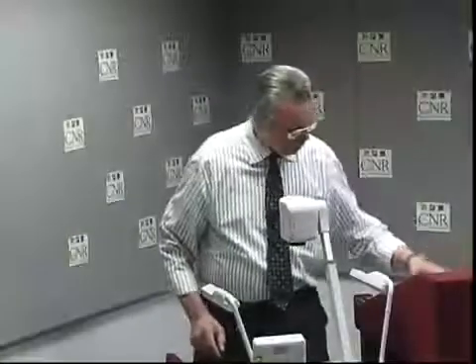And the black card, you see here, is not very good on the reflectance with the light, but this is black. And then you are also provided with light gray dots, which you can hardly see in this image.